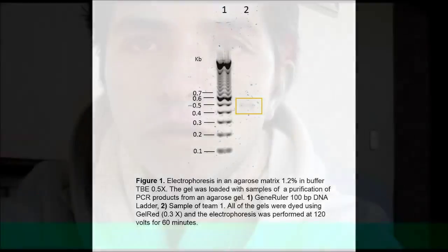The purity of the samples was different from one another. The first sample, non-purified, had a ratio of 1.875, and after purification we had 1.15. This could mean that during the purification procedure using the kit, some contamination like proteins or salts could have been acquired, and therefore a low quality sample according to the kit. It is relevant to analyze the obtained DNA after purification to determine DNA yield and purity.